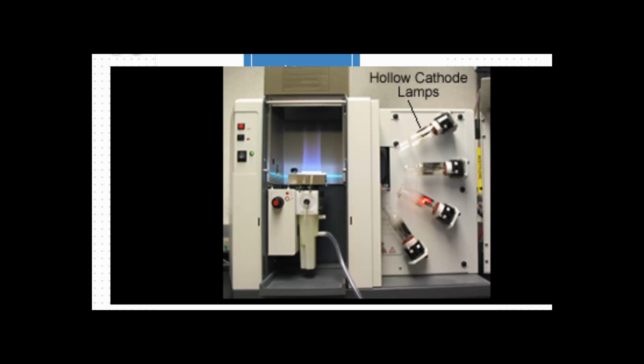So again, absorption is a ground state phenomena. With absorption, we're measuring how many of those ground state atoms were absorbing that light. Now, the emission is actually very similar. You make a couple of changes with the instrument. So you either don't have these lamps or you basically turn them off. And then you switch your detector a little bit depending on your instrument. You probably have a little computer console, and you just make a couple of tweaks. In fact, you probably just click the emission button at this point. But then what you do is you read this color.